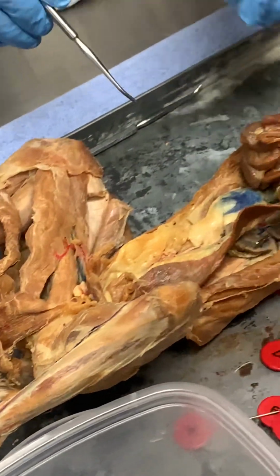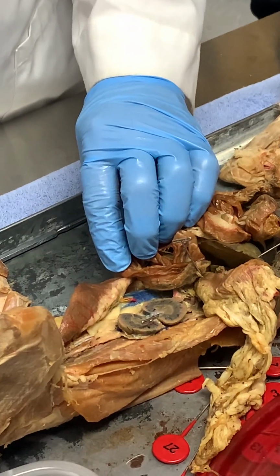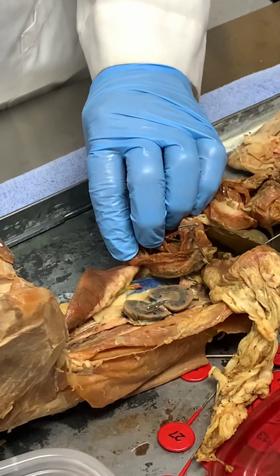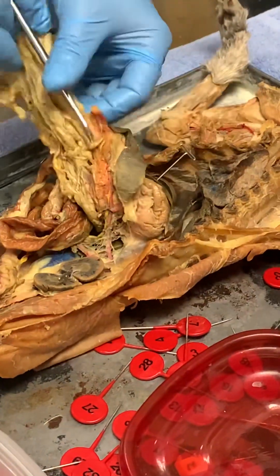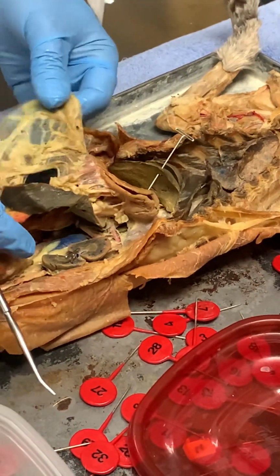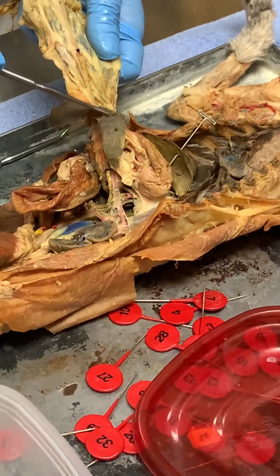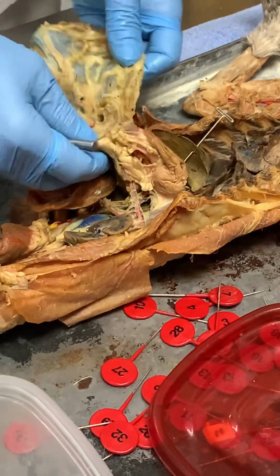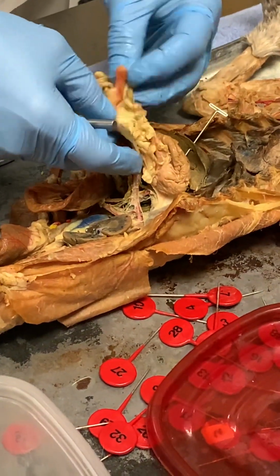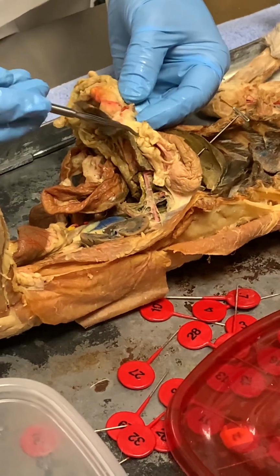Okay, so, did I miss anything on the intestine? Okay, yes, I did. Okay, so within the greater omentum, you see attached the spleen. That's easy, the spleen. But one that's a little higher than that, that's usually a little harder to find. This is the pancreas.